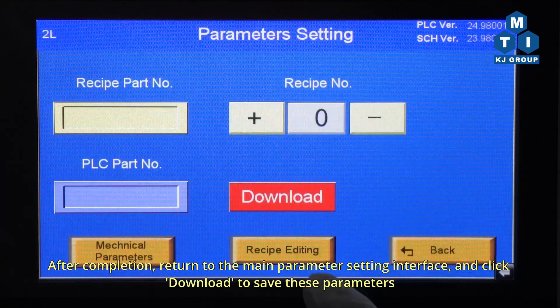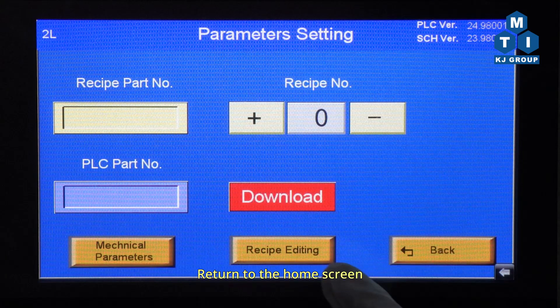After completion, return to the main parameter setting interface and click Download to save these parameters. Then return to the home screen.